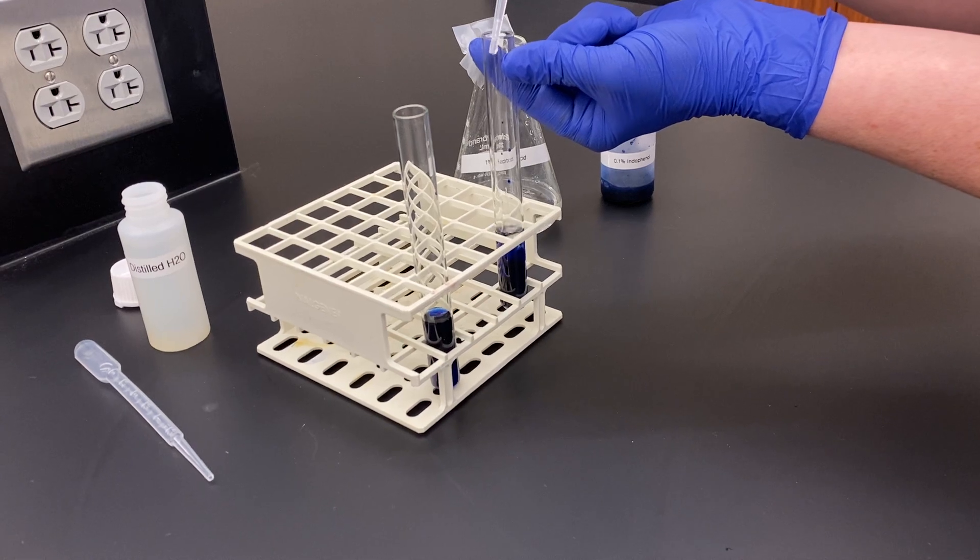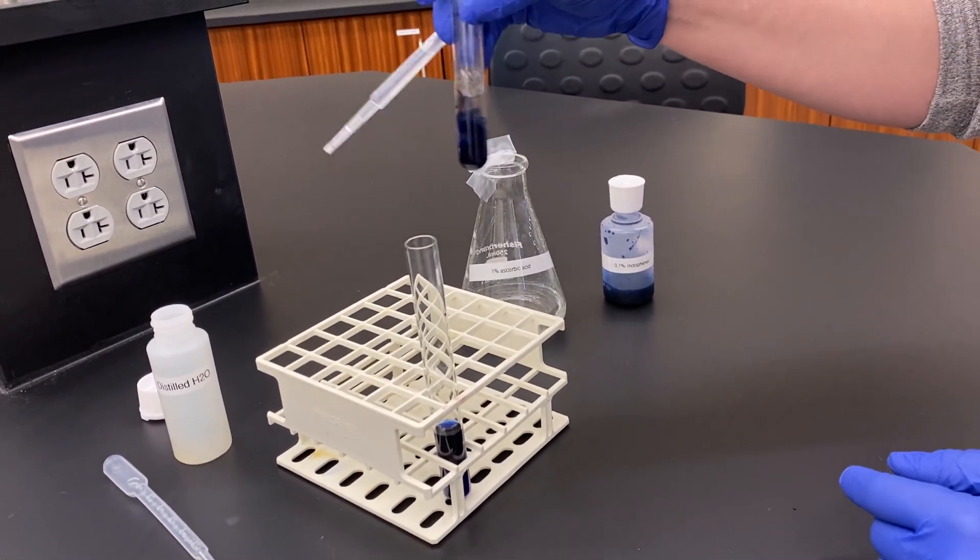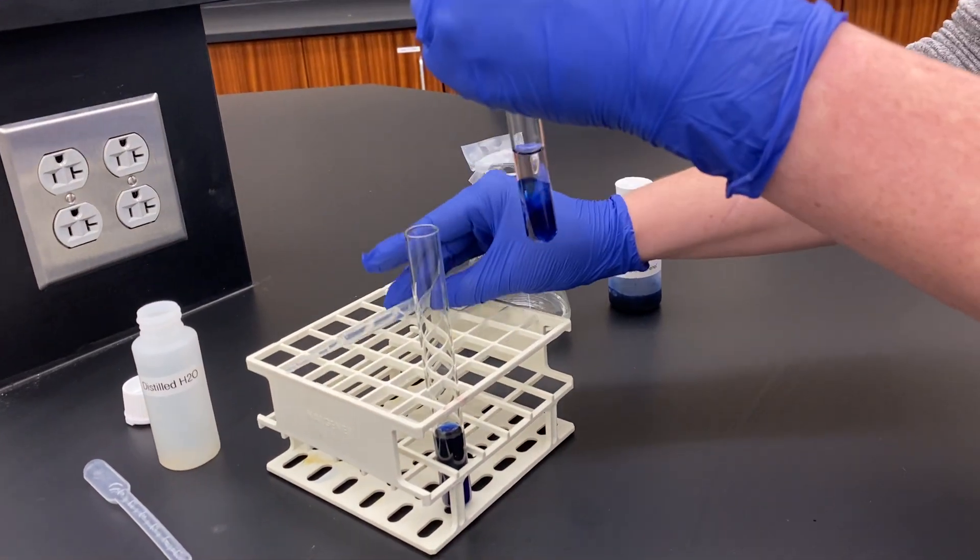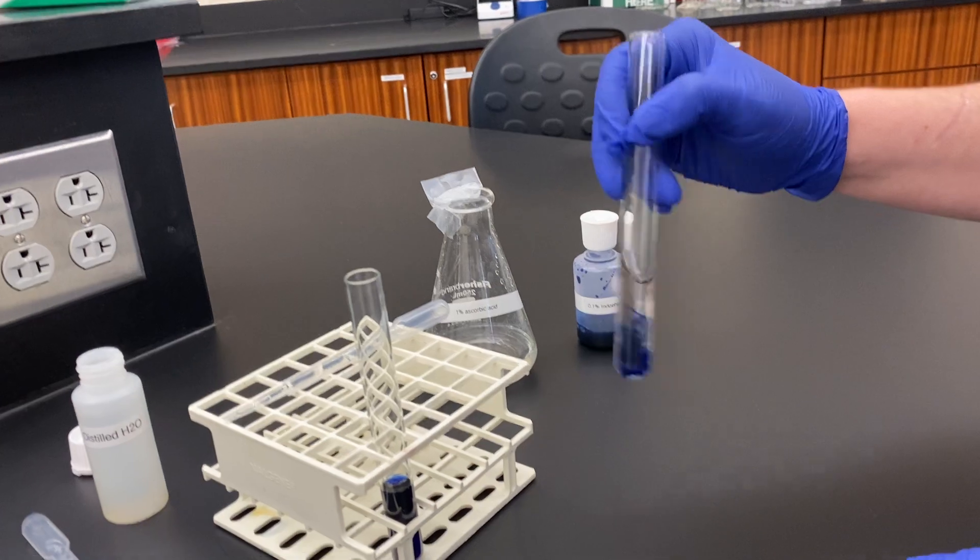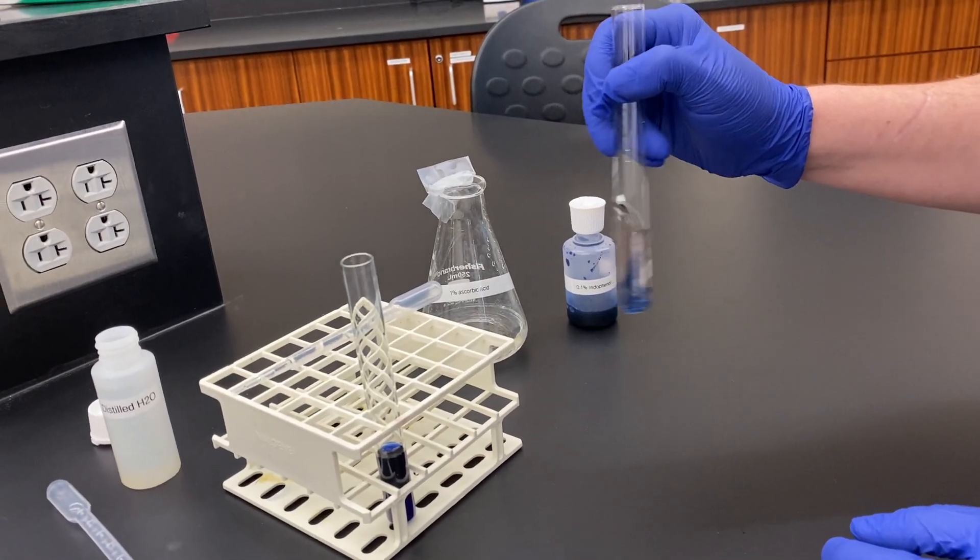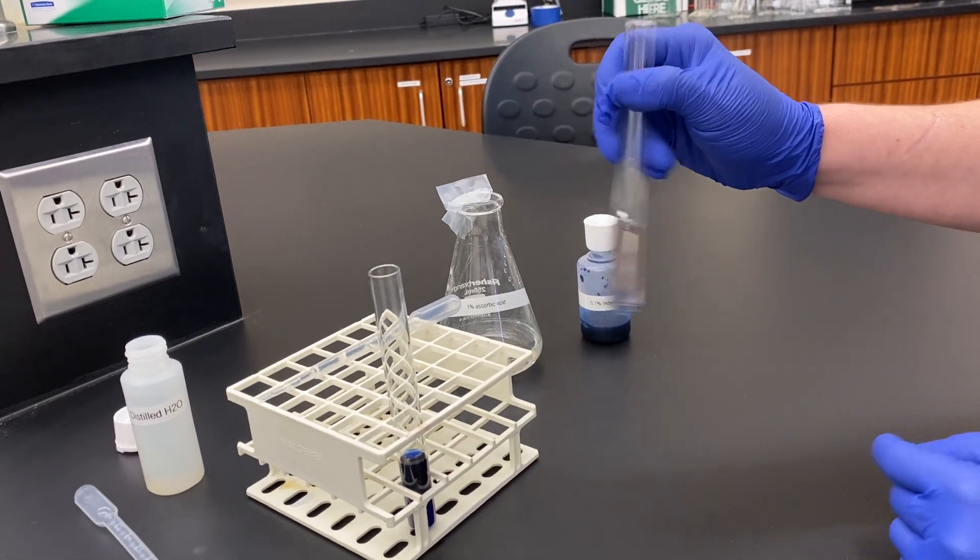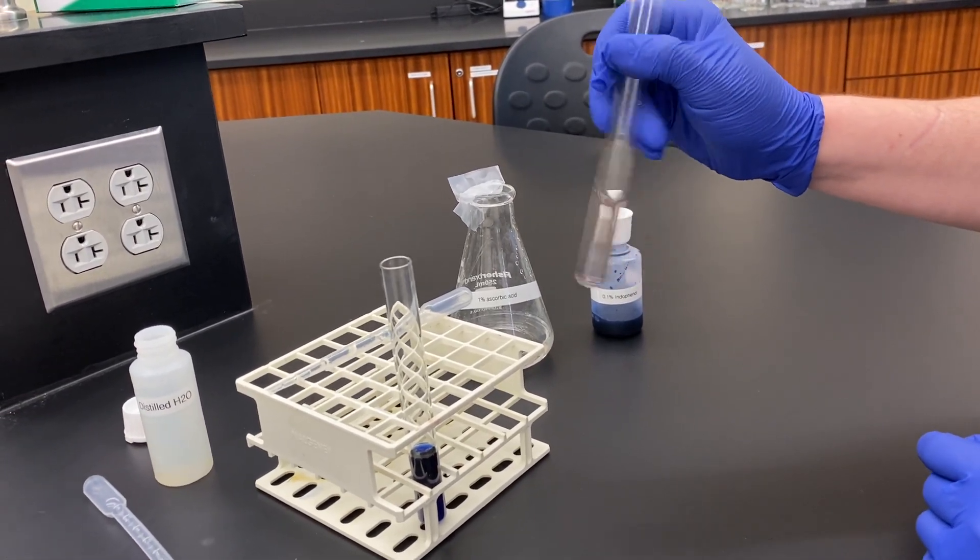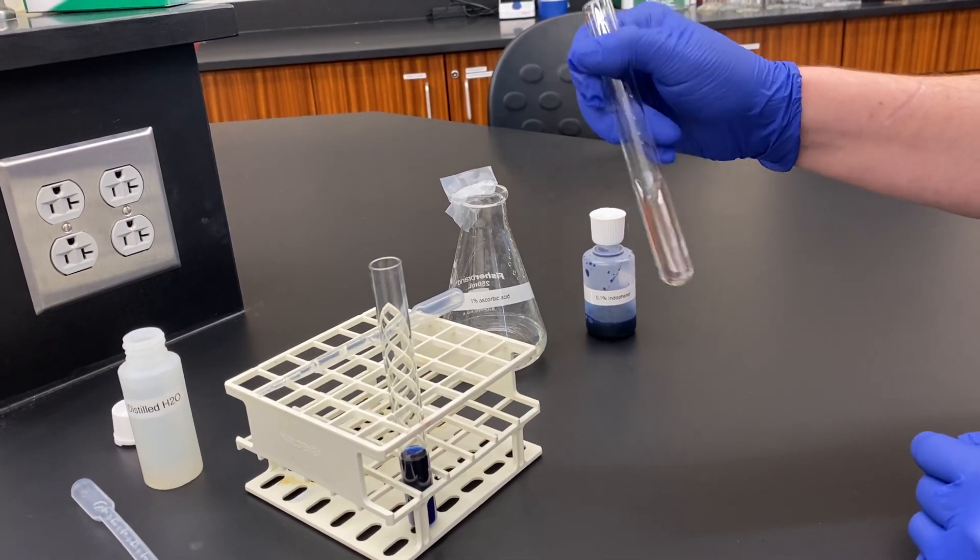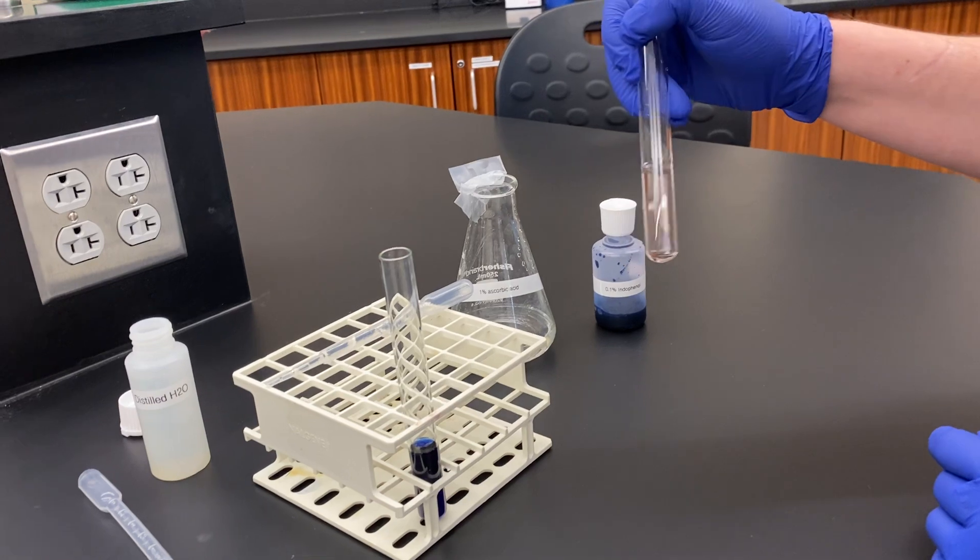I'm going to start to just swirl it, and you can see as I swirl and interact more of that vitamin C, I start to have a decoloration of the solution. As I continue to shake, that endophenol is being reduced by the vitamin C. Adding about a milliliter of vitamin C was enough to fully reduce the endophenol in this solution.